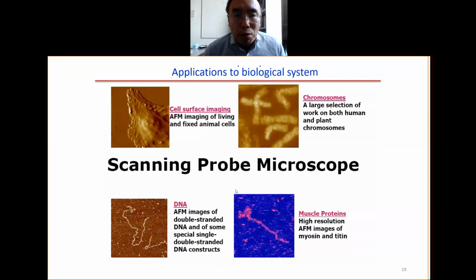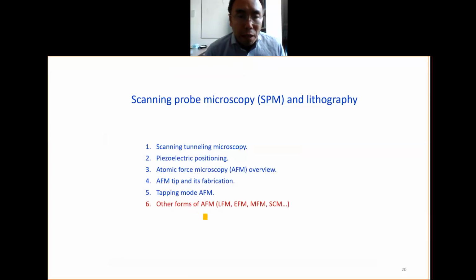For the AFM, we know that it can operate in a liquid. It's good for biological imaging, such as cells, chromosomes, proteins, and DNA. Now let's look at other forms of AFM.